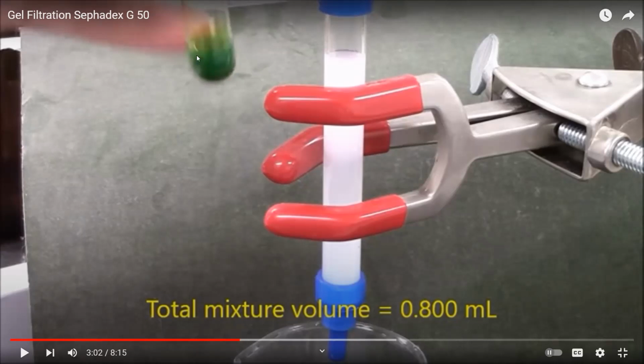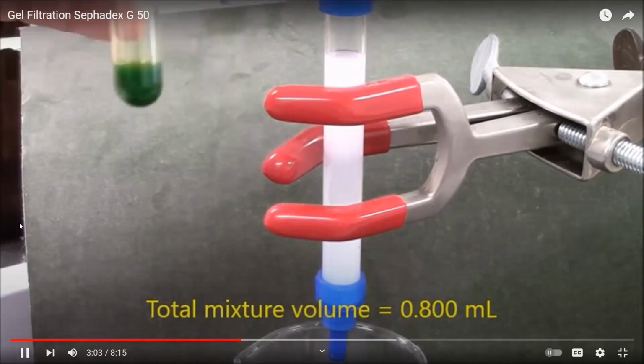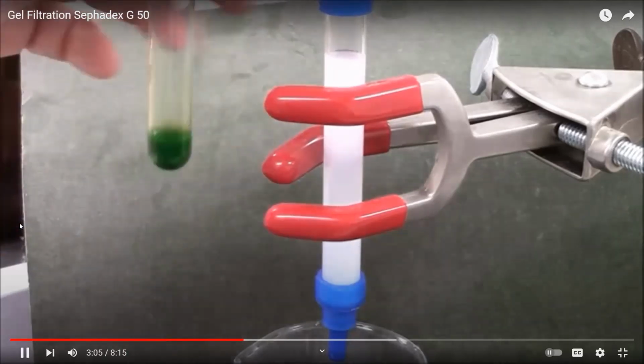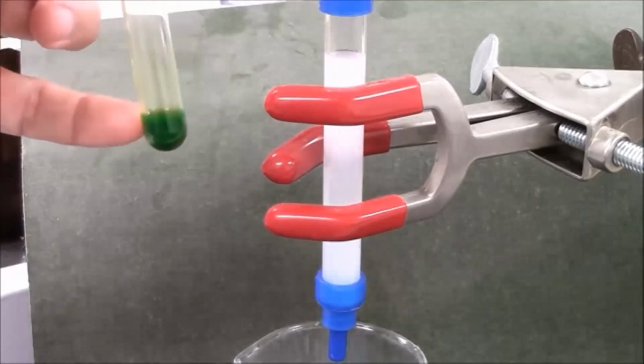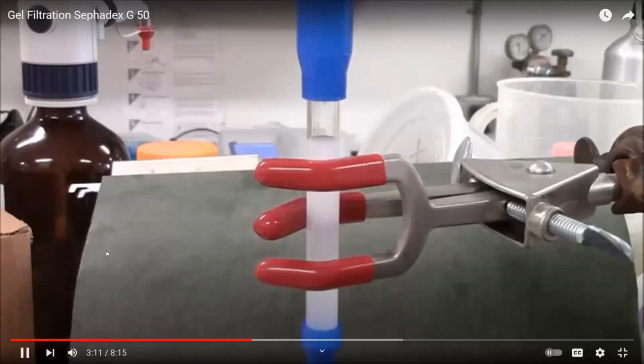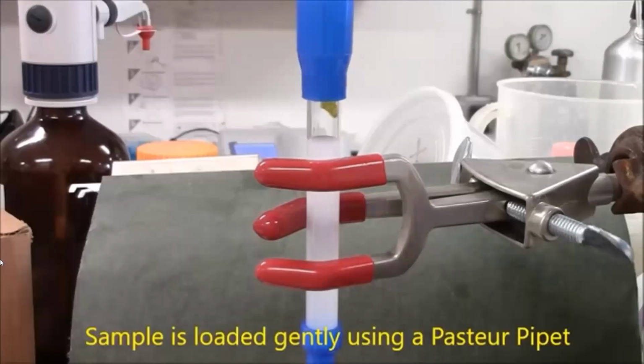And this should be a quick process, not that you remove the buffer and start loading your sample after 2 hours of removing the buffer, because that might dry your column. So he has removed it just before he's loading the sample. For this size column, this is getting near the maximum I would put on the column. I'm using a Pasteur pipette to gently load my material onto the column without disturbing the gel bed.